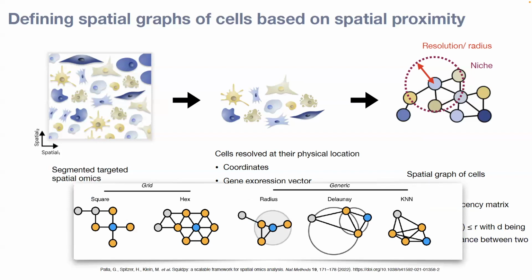So yesterday, for example, there was Visium data also. Visium data comes in a very structured way. So you could, for example, build your graph in a hexagonal way by always connecting the same number of spots. Or if you want to constrain yourself and be as similar to the KNN graph we all use on a day-to-day basis in single-cell RNA-seq, you can go back to the KNN graph. However, typically, I recommend to rather use something biologically informed and use the radius as an initial analysis, because the KNN graph can have one important aspect.